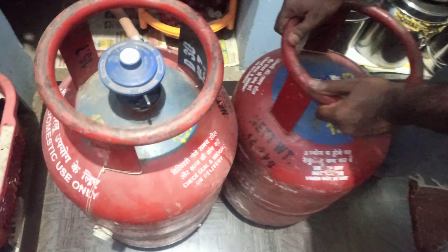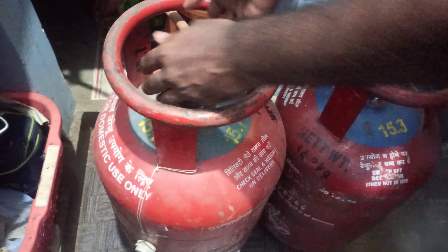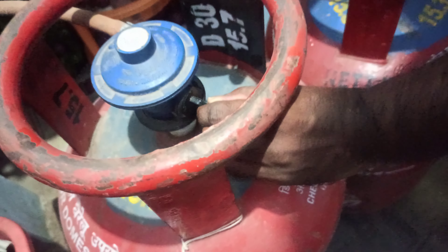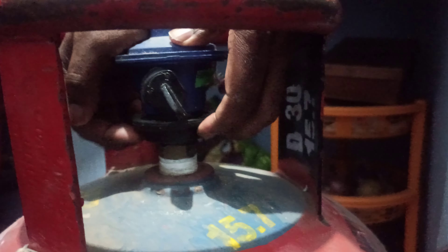If you want to exchange the gas cylinder — if the one that's filled needs to be swapped out — you can't just remove it directly. First, you need to turn off the regulator. Put it down, then press this and remove it. So this gas cylinder is now empty.